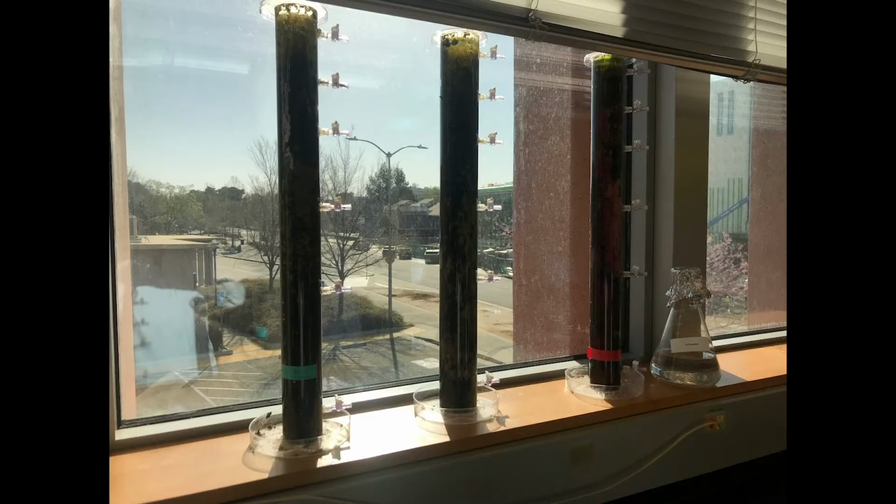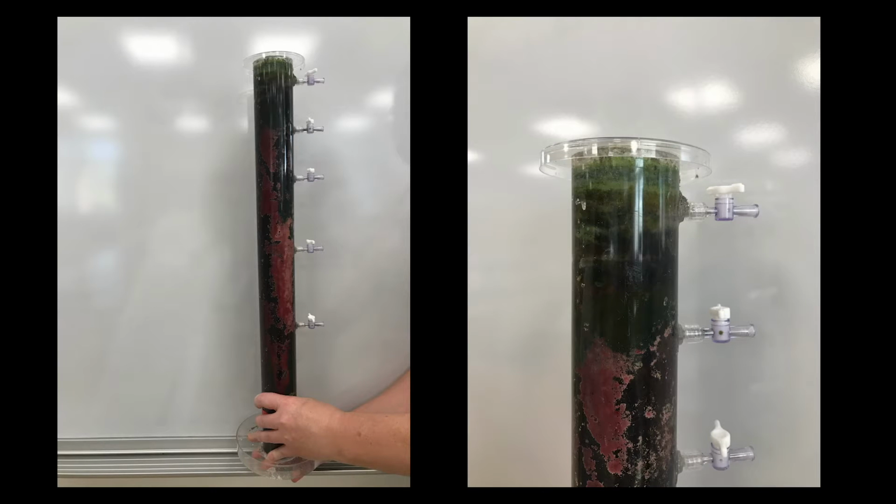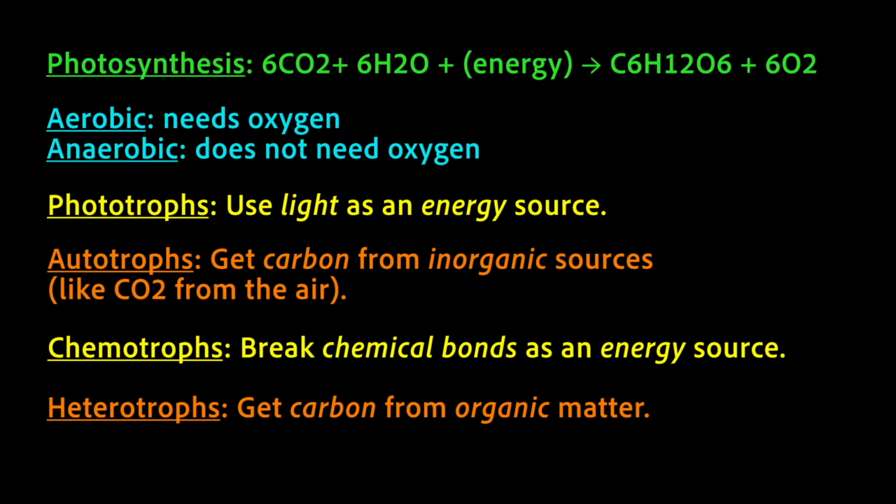Here is a well-established Winogradsky column made by the microbiology students in the Microbial Diversity Lab Mic 105L. We can expect to find photosynthetic microorganisms such as cyanobacteria at the top layer of a column, since here they have access to the most sunlight and to the air, from which they need carbon dioxide. We are also more likely to find microbes that do aerobic respiration near the top of the column, and microbes that do anaerobic respiration nearer to the bottom, where they have minimal access to oxygen.